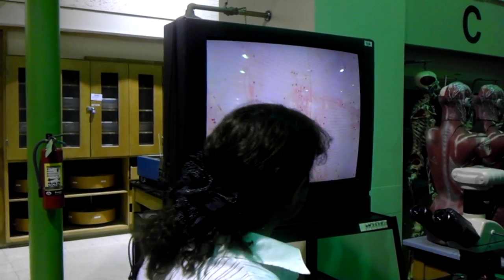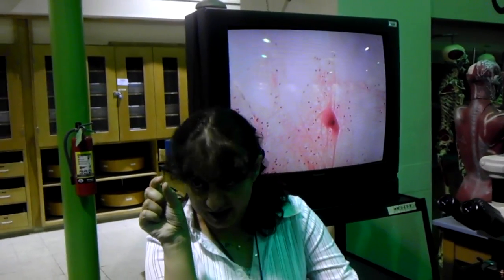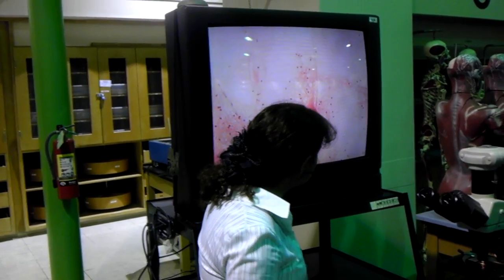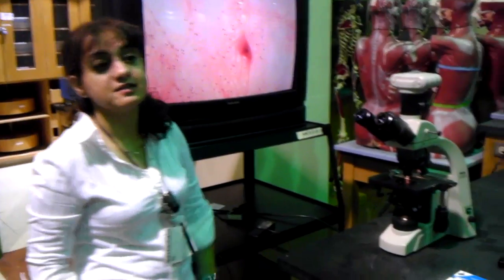But how do you know that this is the axon and not the dendrite? It's bigger, a little bit thicker than the dendrites. And also look at the junction between the axon and the cell body. The junction of the axon into the cell body is a cone-shaped structure which is called the axon hillock, right? Good. So axon hillock is the clue which helps you to distinguish that this is the axon, not the dendrite.